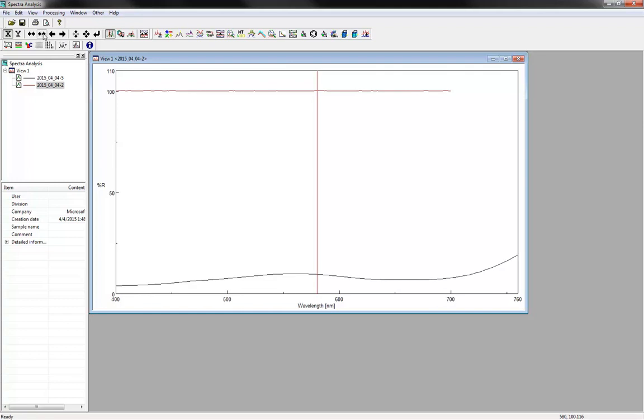If you select the X-axis, these icons move the spectrum to the left or to the right. Selecting the Y-axis moves the spectrum up or down. Autoscale Y-axis resets the vertical axis to autoscale, while the full scale icon resets the scales of both axes in the current view. The Trace icon allows you to display coordinate data at an arbitrary point.